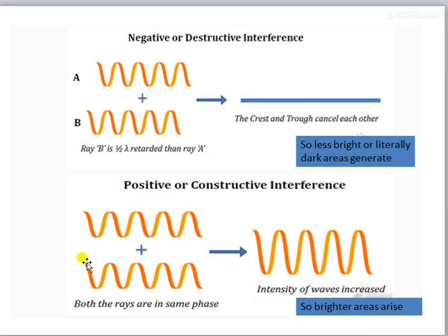Now let's look at this. I'll tell you how the difference in wavelength arises. Consider two different points on a particular specimen, A and B. If light passes through point B and it has a higher refractive index, consider such a case. If B has a higher refractive index, what happens?